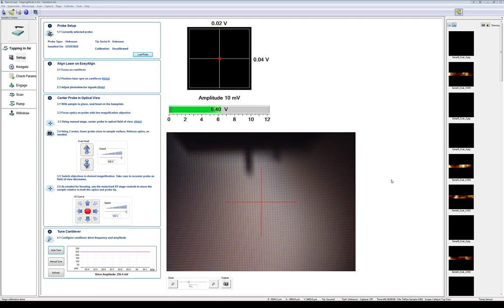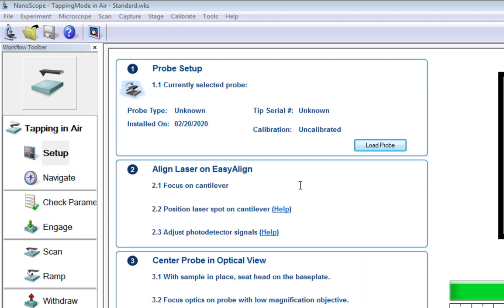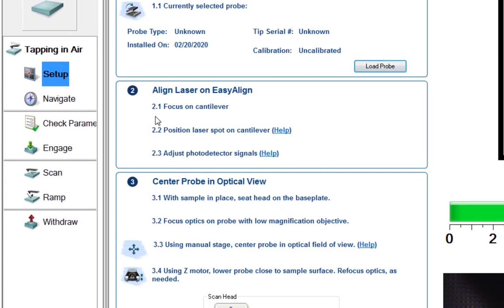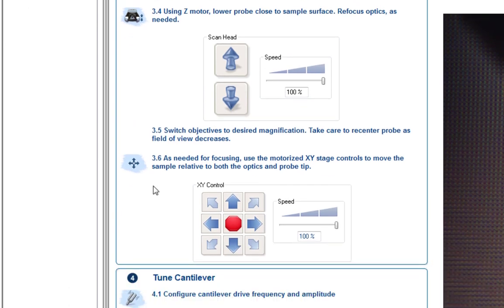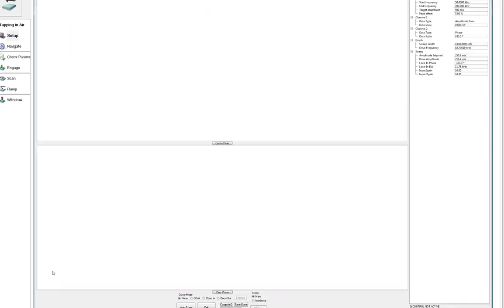Now we have our sample mounted, tip mounted, and have approached the tip to the surface within a reasonable distance. Next we use the software to take the scan using Nanoscope. They use a top-down left-to-right approach in the interface. In the setup pane we're looking at the probe setup section — we set up our probe, aligned our laser, centered the probe in the optical view, and approached the surface. At the bottom is the tuning section. We actually need to tune the cantilever, so I'm going to open the manual tune window but we'll use autotune — it just helps us see things more easily.